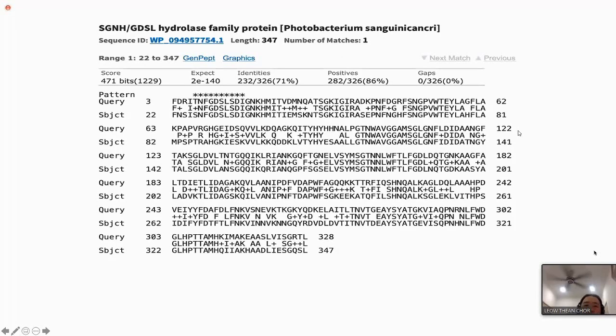After you perform a PHI-BLAST search using the pattern and also the input amino acid sequence, this is one of the results for the first iteration that is reported to you. Different from BLASTP, you will see something extra here, an asterisk on top of the patterns.